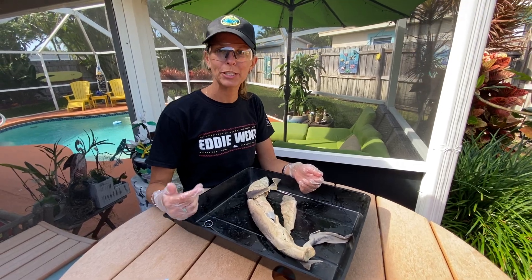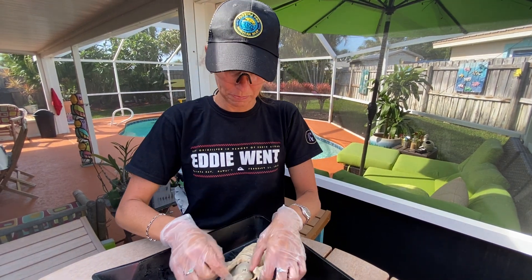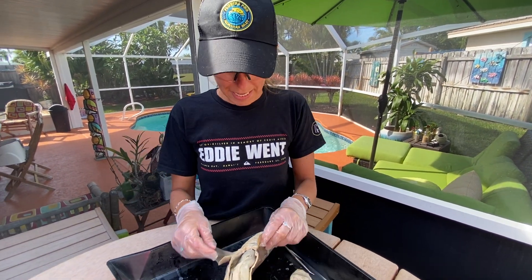Hey everybody, welcome to the internal dissection of our spiny dogfish. I'm really bummed that you can't get the full experience with the smell and the oiliness of this, but this will have to do at this point.